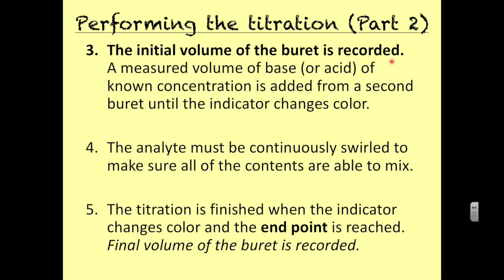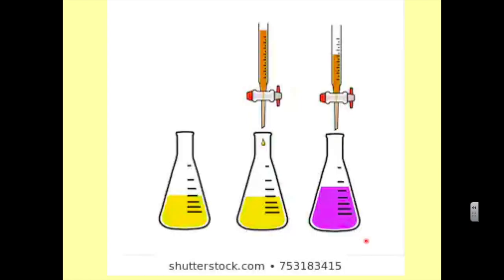So many students will forget to measure this. They'll only go after the final volume, but it's useless unless you remember to measure the volume of the burette twice. You have to measure at the beginning and you have to measure at the end. So watch out for that.